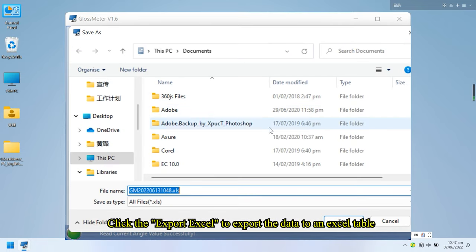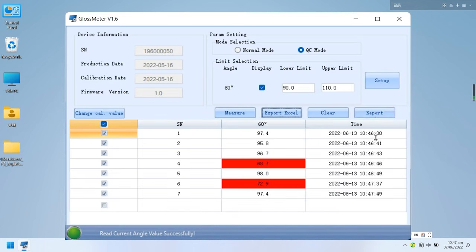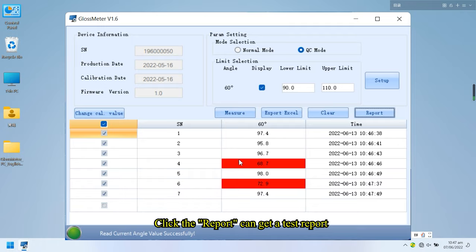Click the export Excel to export the data to an Excel table. Click the report, can get a test report.